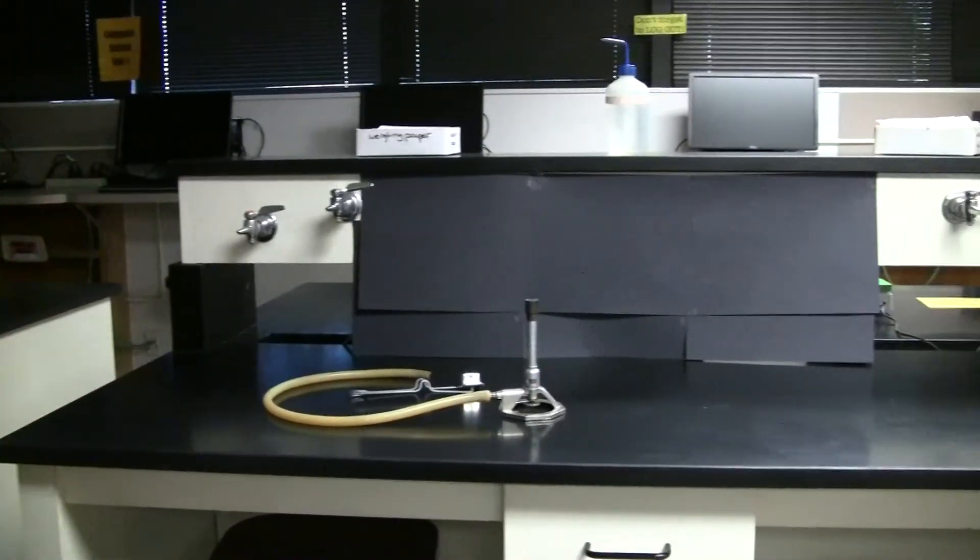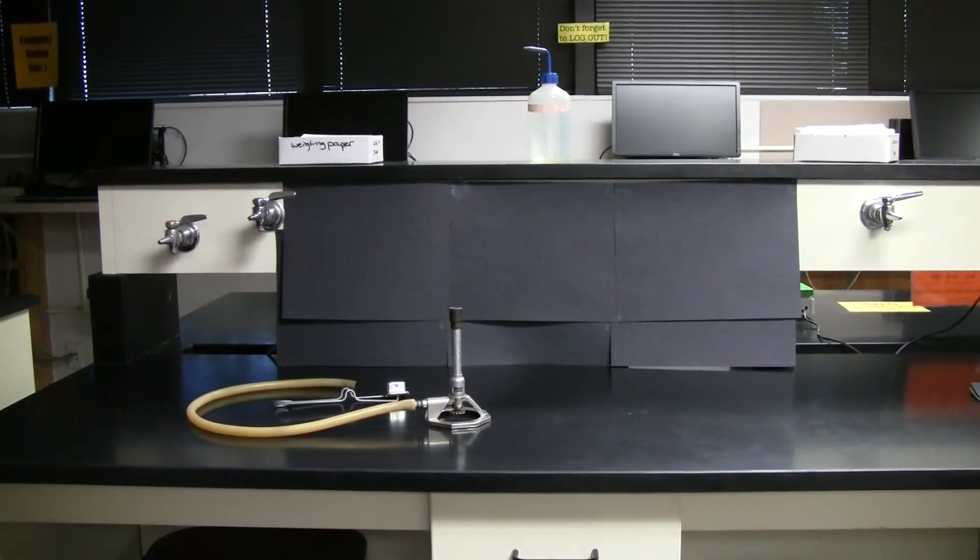Now let's talk about Bunsen burner safety. To start this process, you'll go and obtain a Bunsen burner and a striker from the cabinets underneath the hoods.